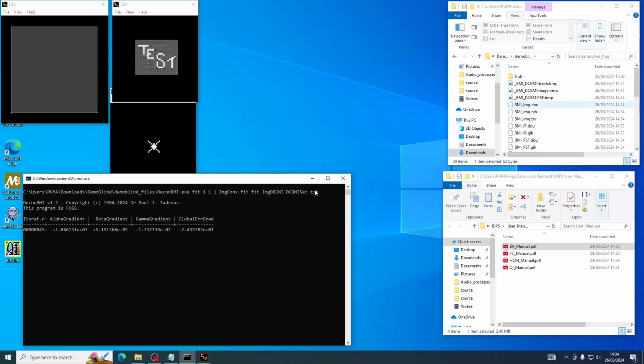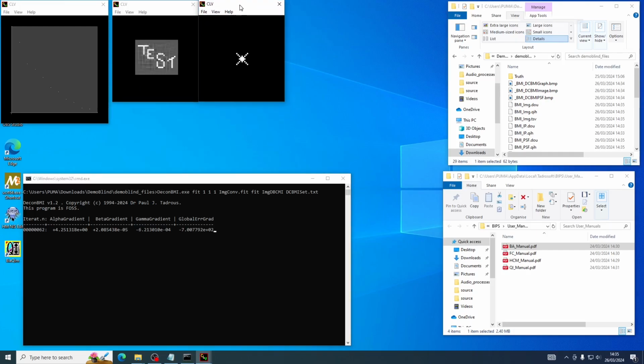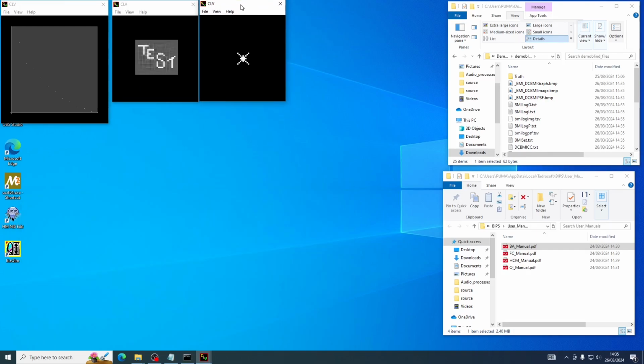If you want to run this program on another operating system like Linux or macOS, you won't be able to do it by just double-clicking on the bat file. So I'll talk more about that in the sections on Linux. This demo also demonstrates the use of this program, CLV, Command Line Viewer, which is part of the BiaQIm Image Processing Suite. You won't be able to run this demo unless you first installed the BiaQIm Image Processing Suite.